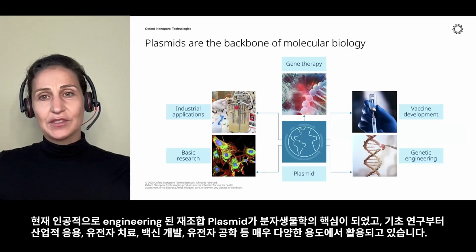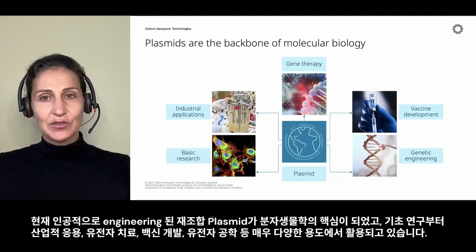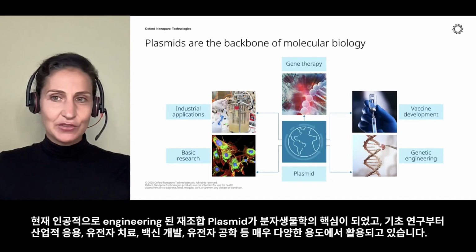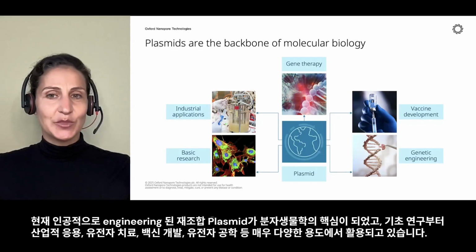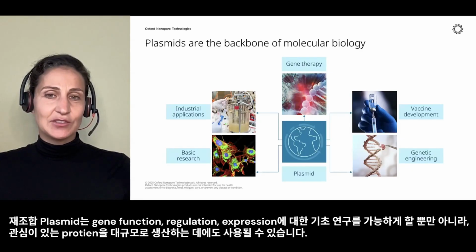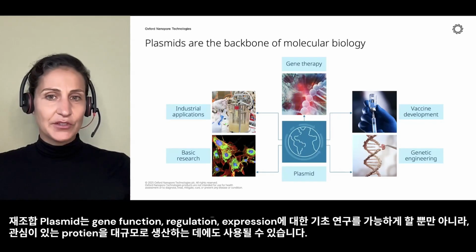Plasmid constructs that have been engineered now are the backbone of molecular biology, and they serve as fundamental input material with many different uses, all the way from basic research to industrial applications, gene therapy, vaccine development, genetic engineering, and much, much more. They can be used to enable fundamental studies into gene function, regulation, expression, as well as for large-scale production of proteins of interest.